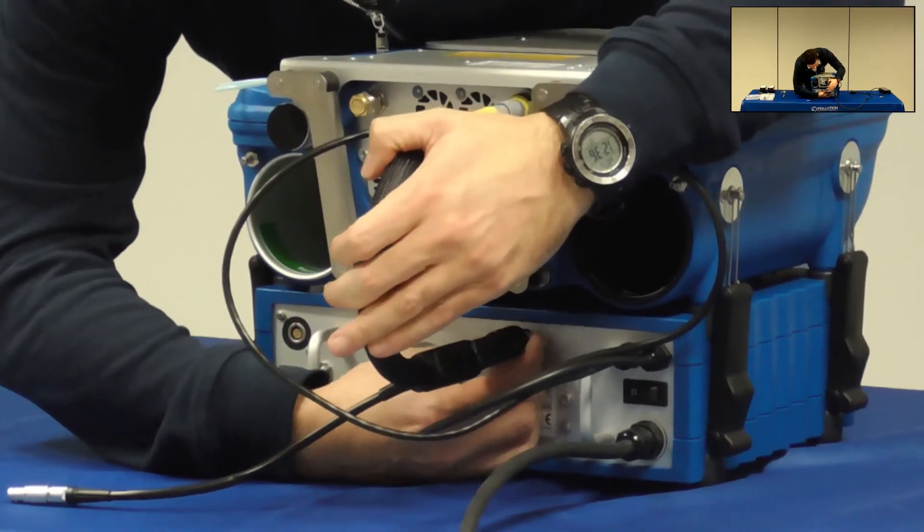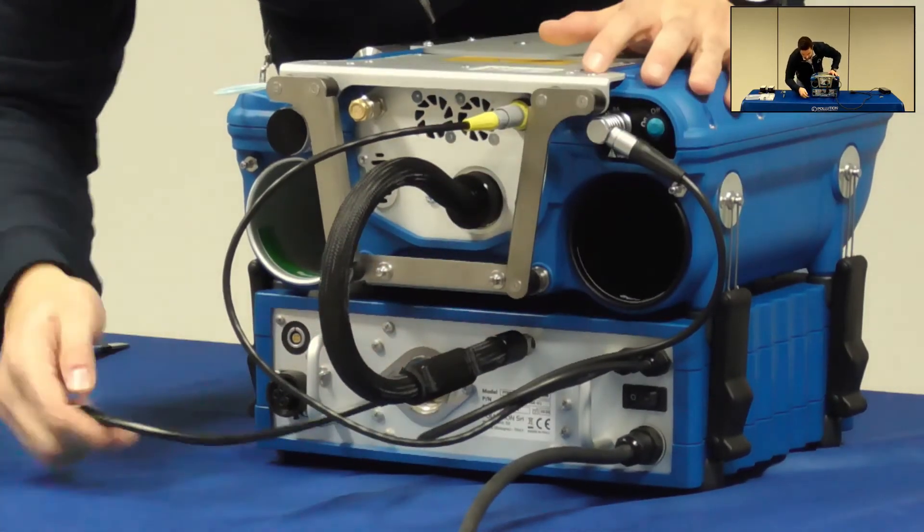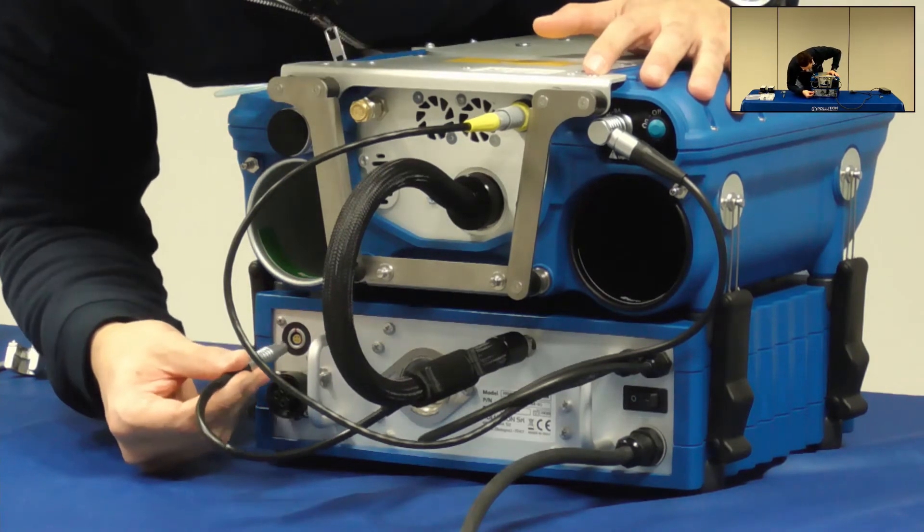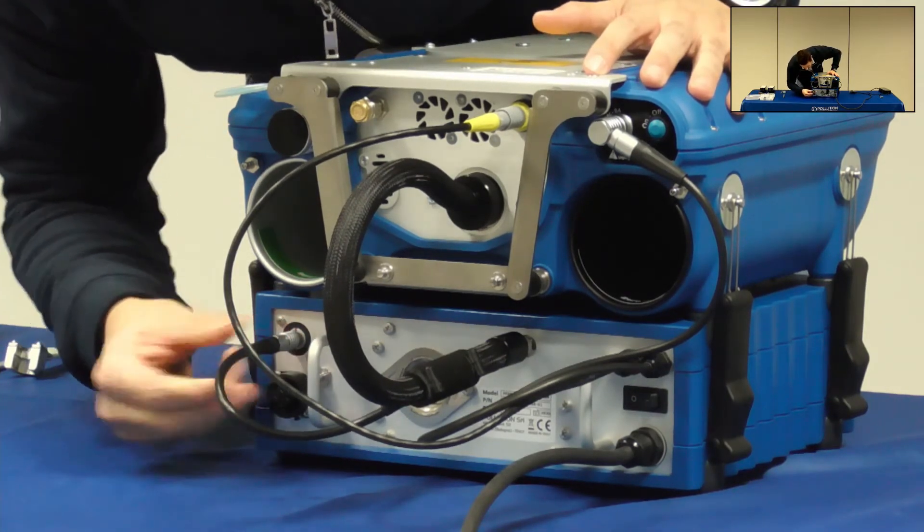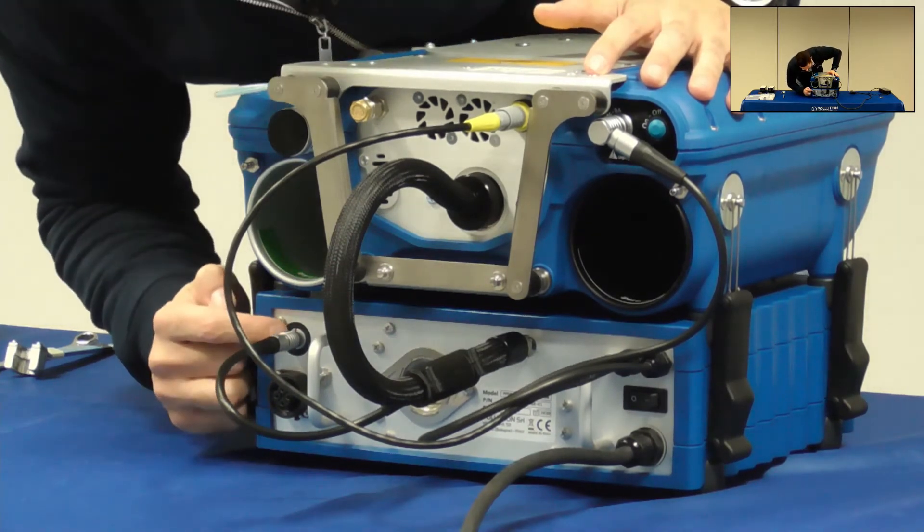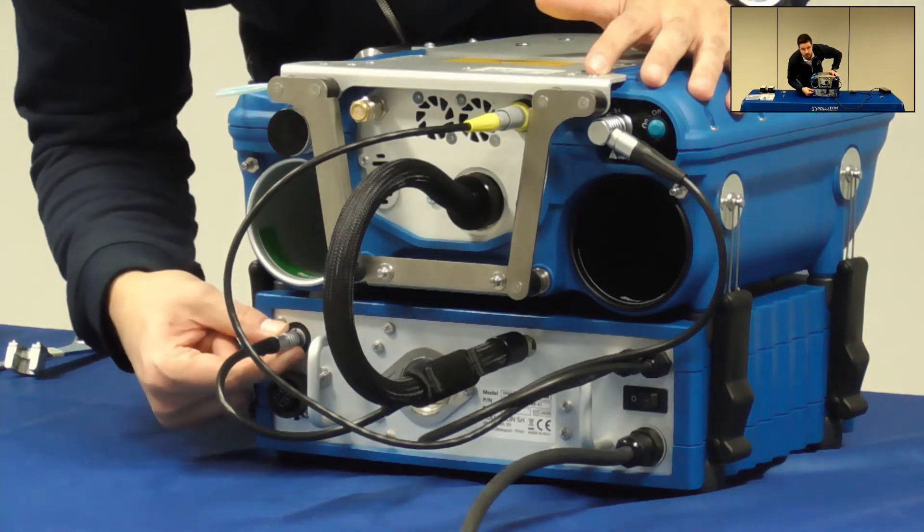You also have the power cable which can be linked in its proper slot which is with a red dot on it. Now the heated transfer line can be heated up to 180 degrees. There is a safety block here that keeps the cable in position.